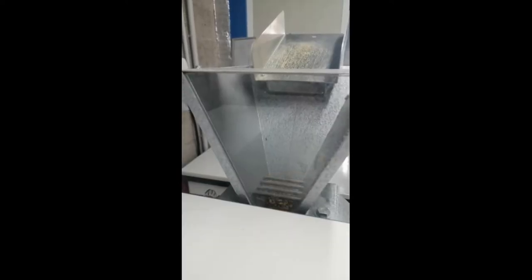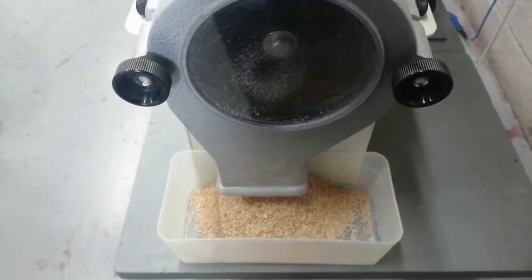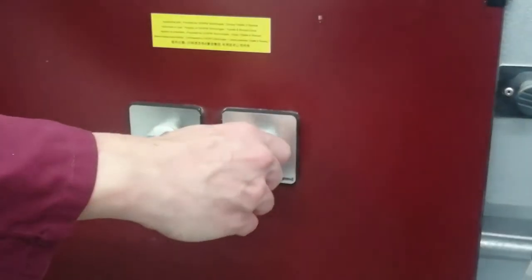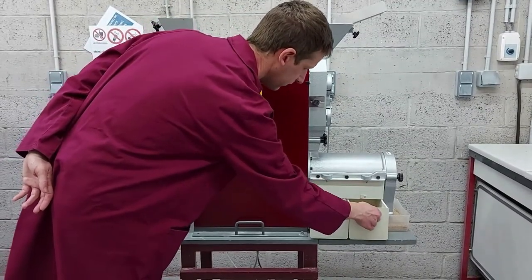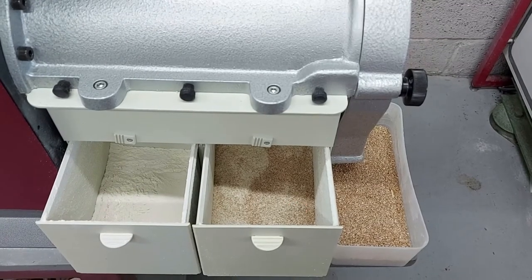When the last grain has passed, wait about three minutes to let the sifting finish, and switch off the instrument. The first part of the milling is completed, and you have obtained three different ground products: breaking flour, middlings, and bran.